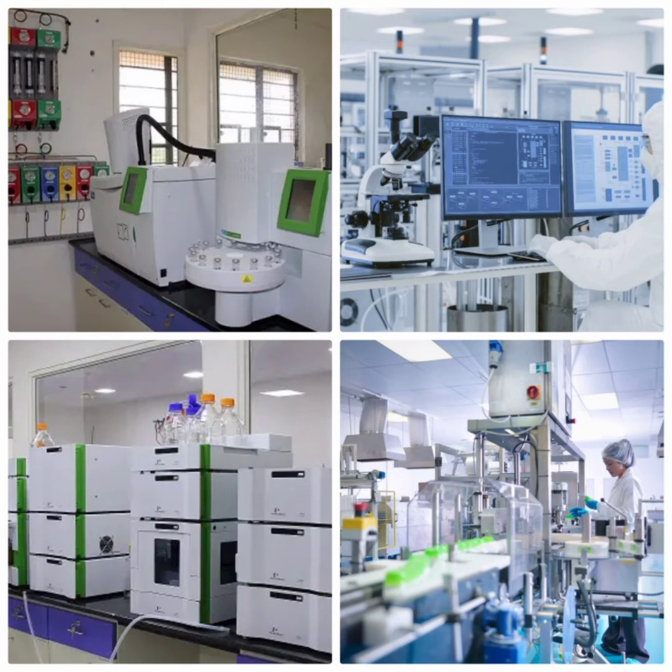There are software packages which are common for HPLC and GC. Most manufacturers supply common HPLC and GC application software as peak analysis and data treatments are common.